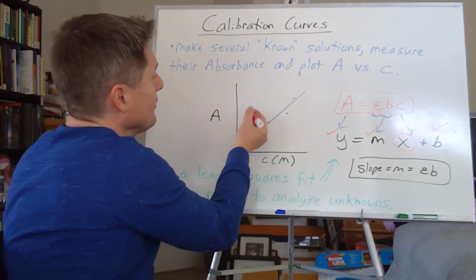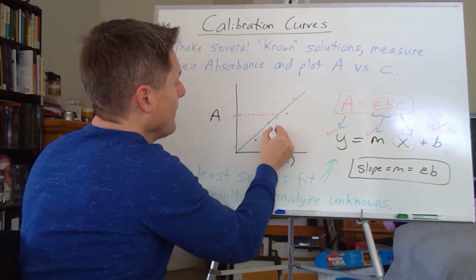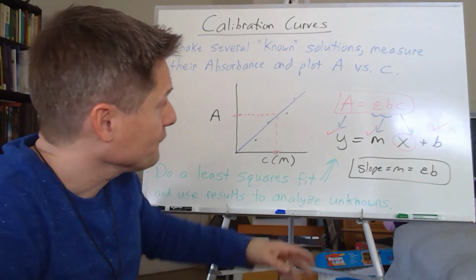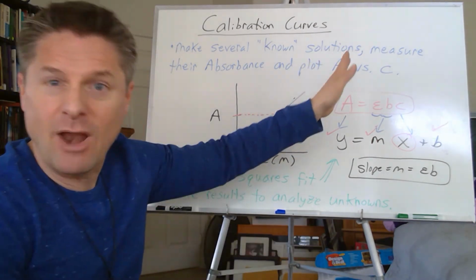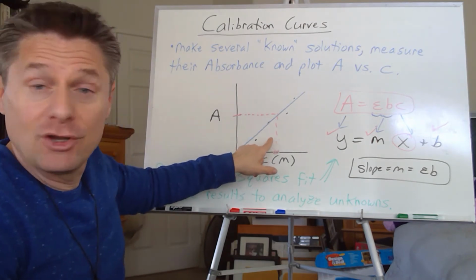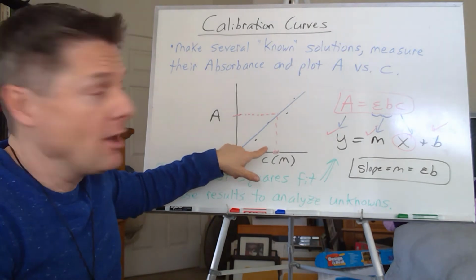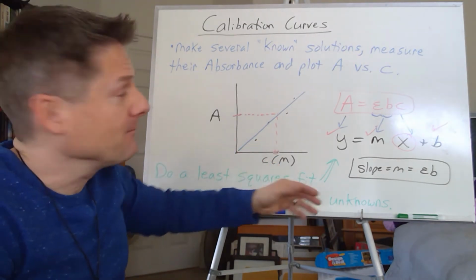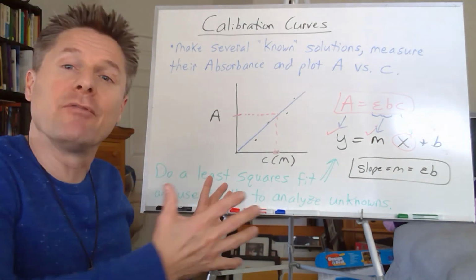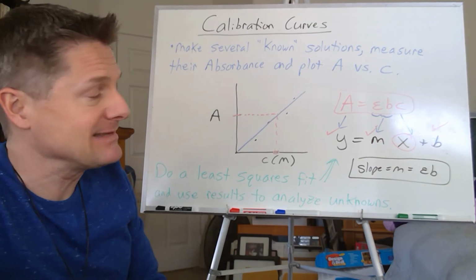You can eyeball it. So let's say our unknown is there. You can just eyeball it over and down and go, hey, there's my concentration, right? Very nice. If it's up here, you have to extrapolate it out and assume it's still linear, right? So we can do it by eyeballing it. What you're going to do is create your own calibration plot and eyeball your unknown, which is fairly accurate. And then we're going to calculate it using Beer's law this way. All right, so that's the essence of the lab, spectrum mode, photometric mode. But it really banks on your pipetting techniques here.